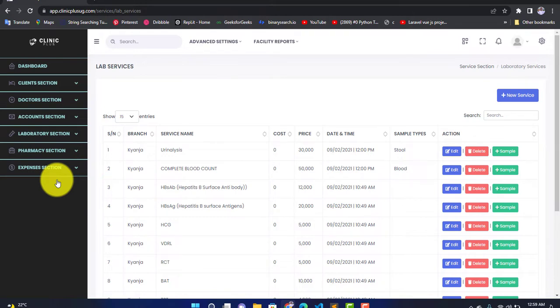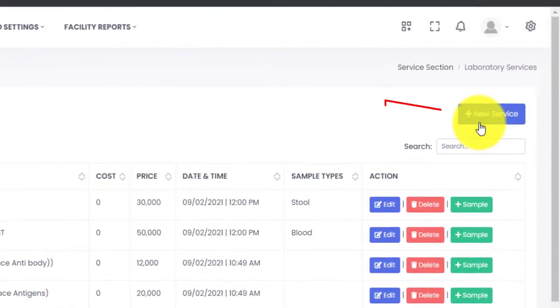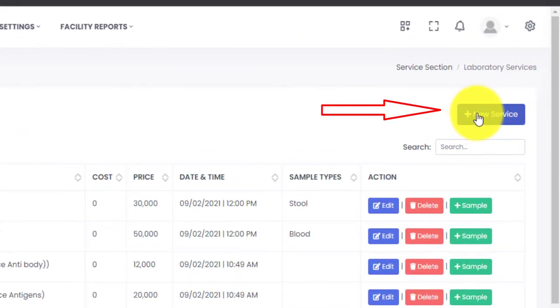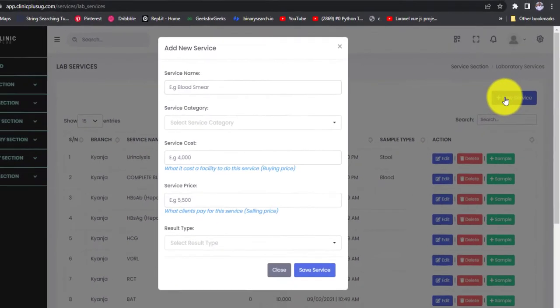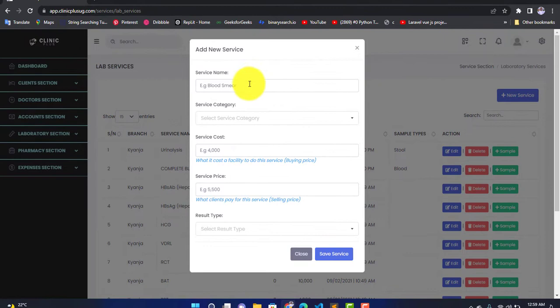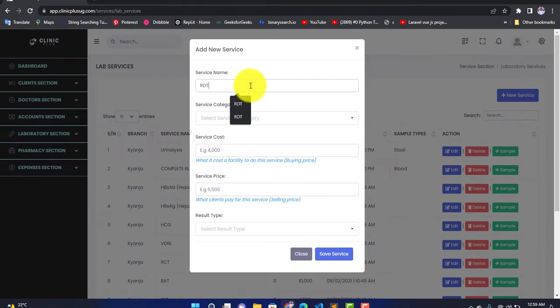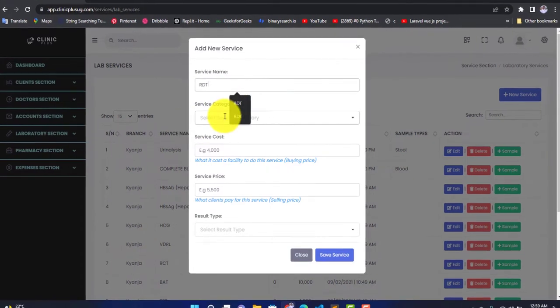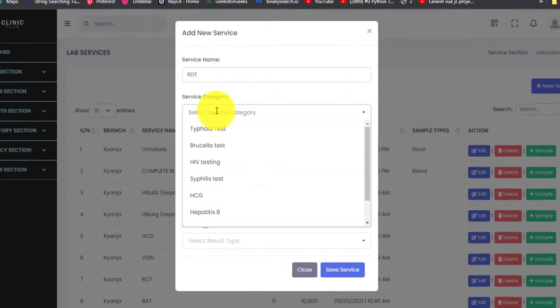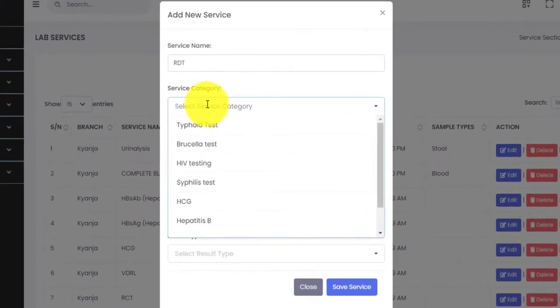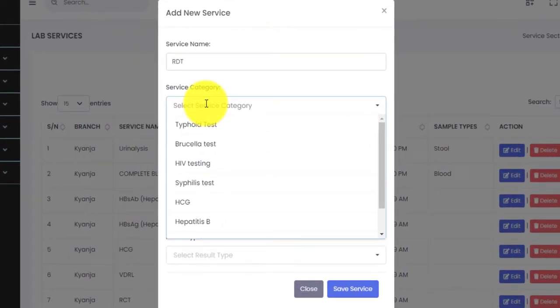So let us add a new service in ClinicPlus software. We are going to click on this button — Add New Service. We shall enter the service name; let us say RDT for malaria, so we are going to type 'RDT'. Then we select the category.